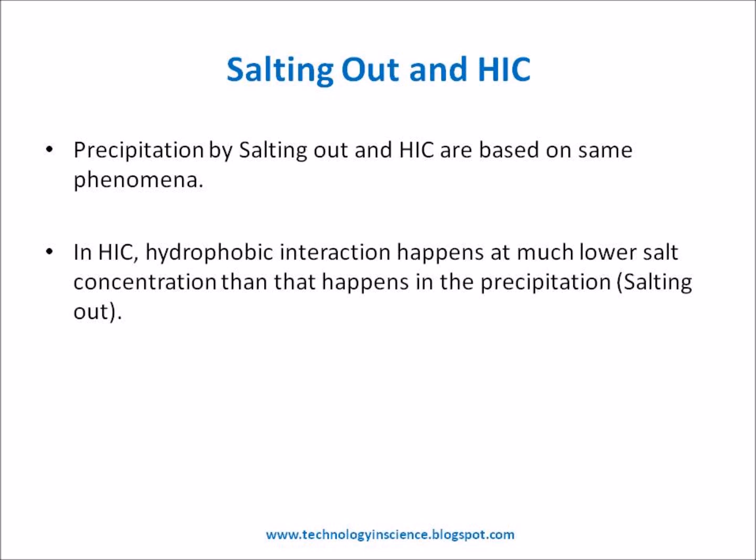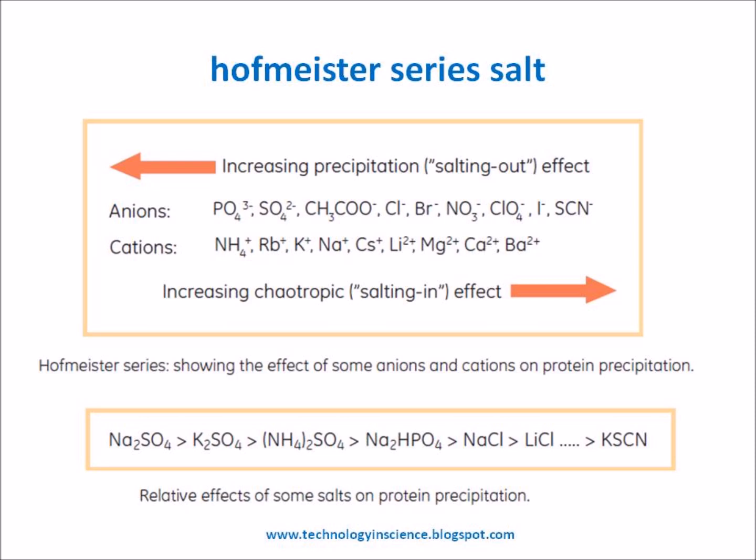The elution or precipitation strength of an ion is described by the Hofmeister series. Small, highly charged ions are strong precipitators, whereas organic acids and bases have a more stabilizing effect in the presence of proteins in solution. The term chaotropic refers to the ability of the ion to produce chaos in the water structure. Anti-chaotropic salts, such as ammonium sulfate and sodium sulfate, expose hydrophobic patches on proteins by removing the highly structured water layer which usually covers these patches in solution.